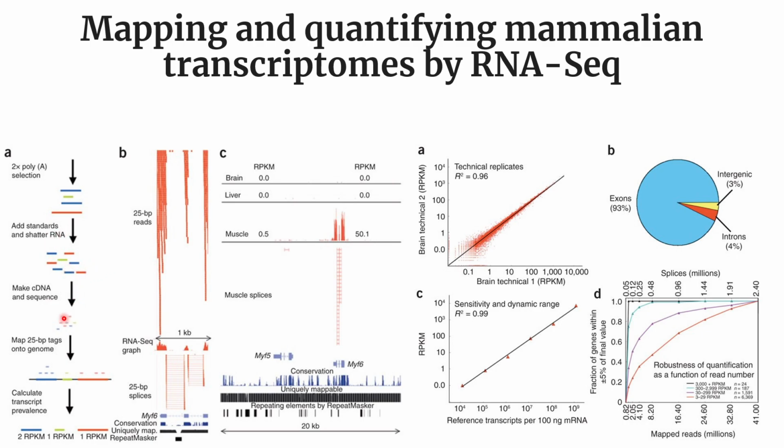Thereafter, it is converted into cDNA, its complementary DNA sequence, via reverse transcription, and then into 25 base pair reads, and barcodes are added, such as Nextera or TruSeq, which are the common barcode tags for Illumina sequencing.